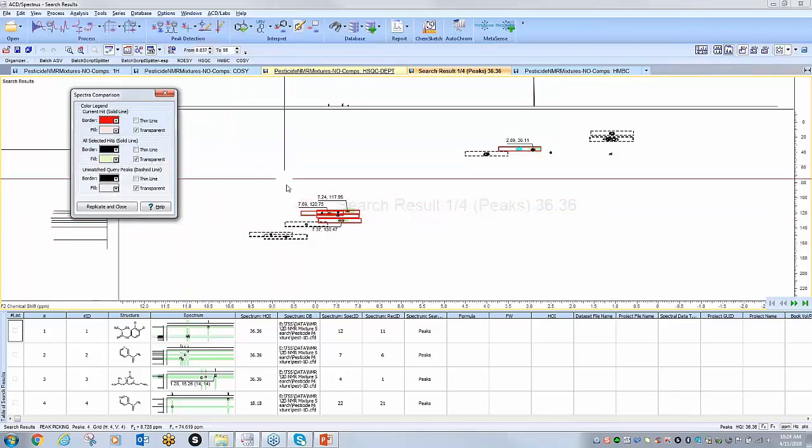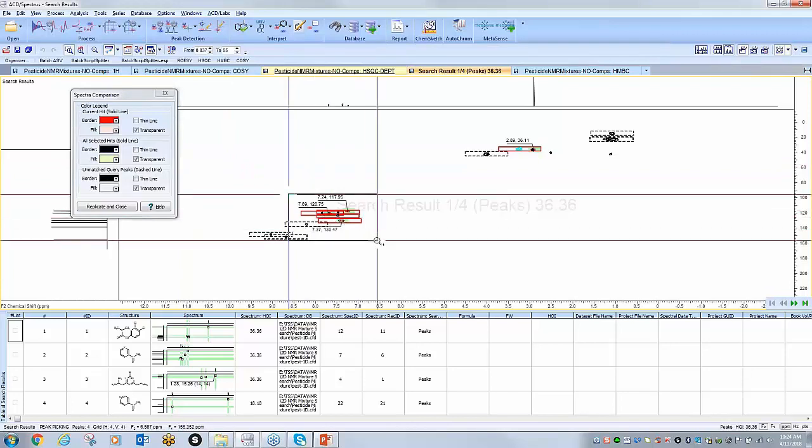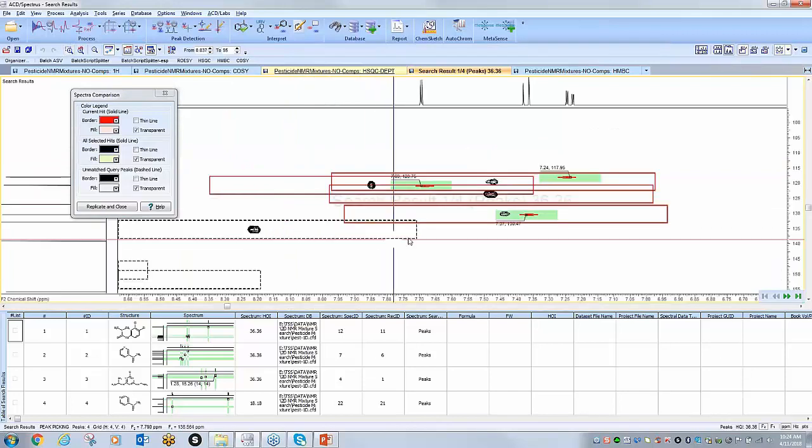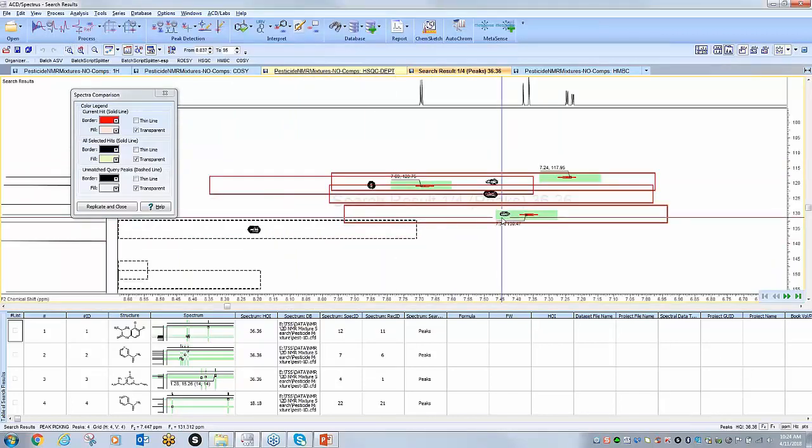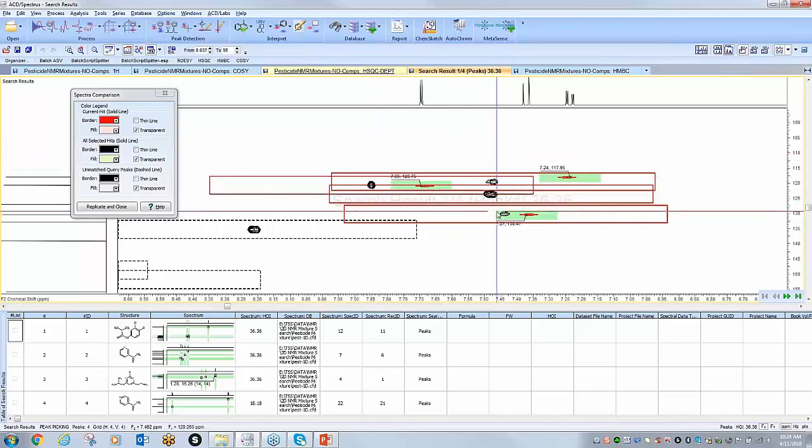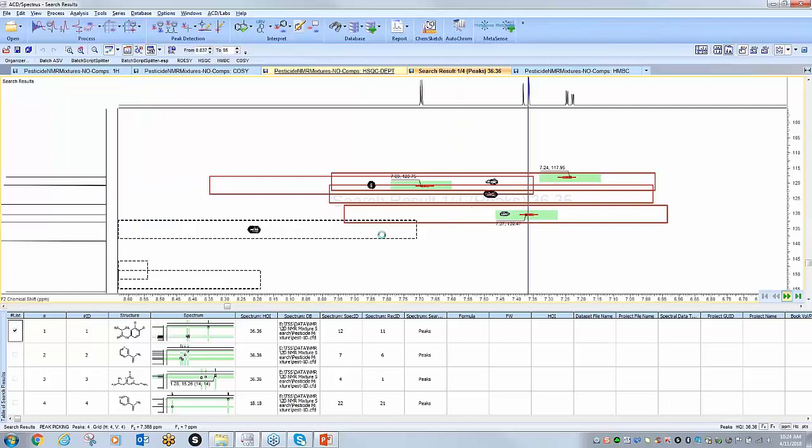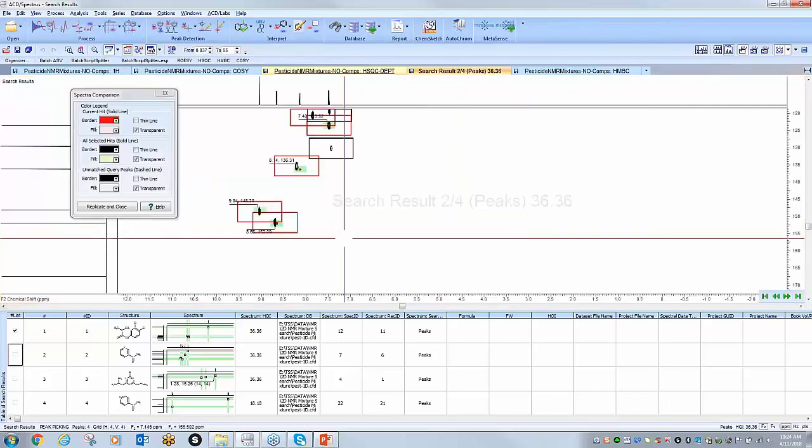Obviously you can adjust the colors to your liking. I'm just going to zoom in to show that in fact I believe this is a decent hit for this particular sample. So I can once again select it from my table of search results and move on to the next.